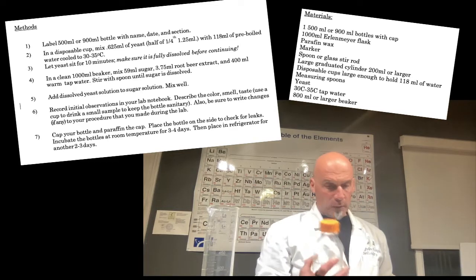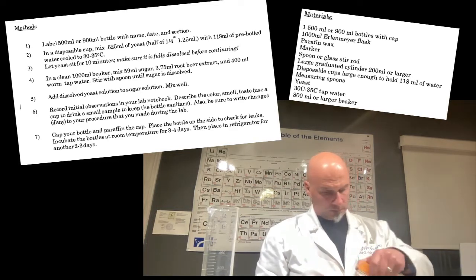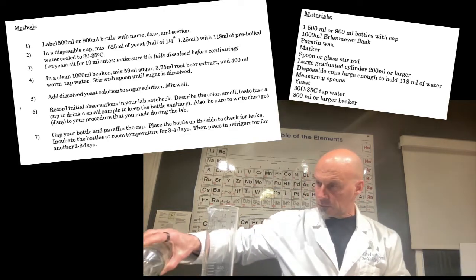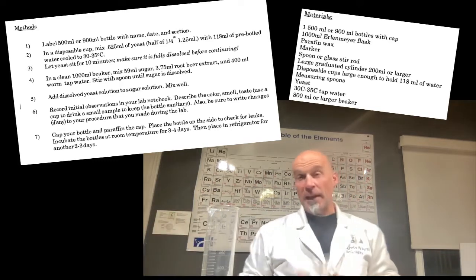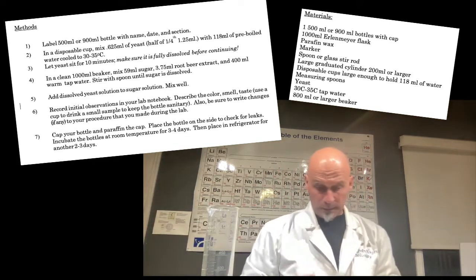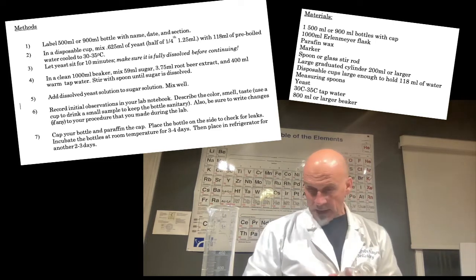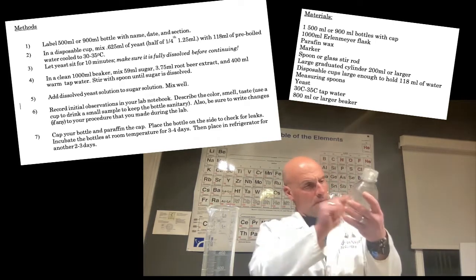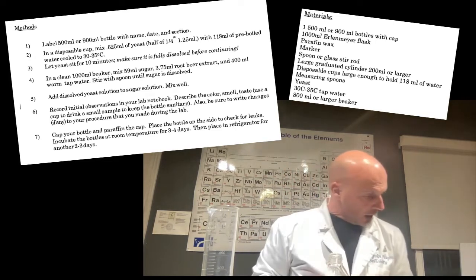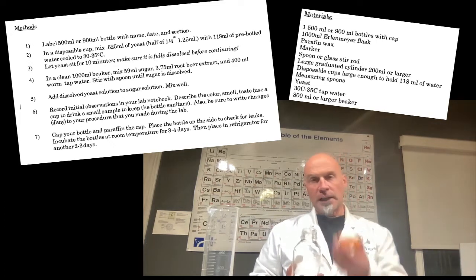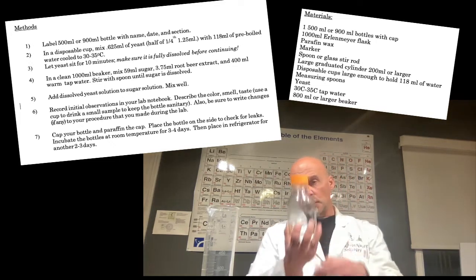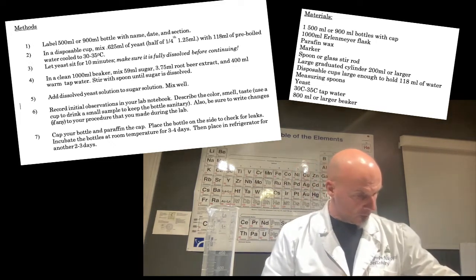Alright, so I'm going to label my empty flask bottle with cap, with my name and section. Okay, name, section, check. Just to keep everything clean, I'm going to put the cap just loosely back on the bottle.